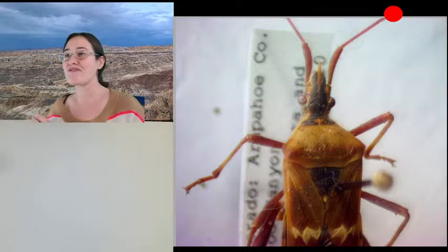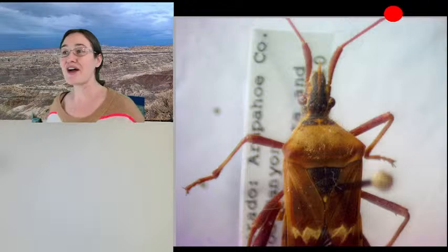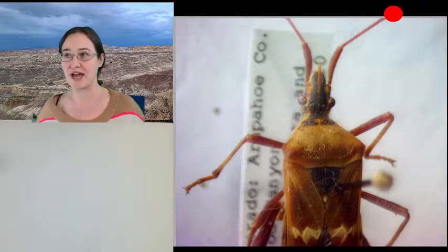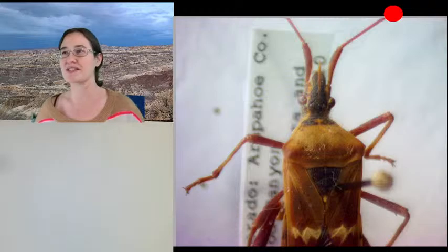Today I have this insect right here underneath the microscope. It is a coreid or a leaf-footed bug. I thought he could be really cool to sketch just because of his variety of crazy leg features, and we'll be able to flip him over and check out his mouth parts and stuff.